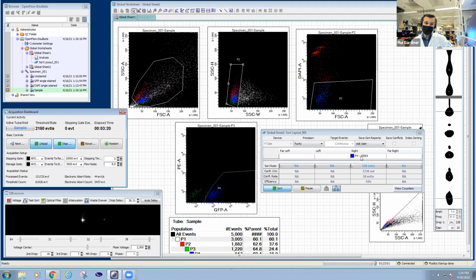And now, like I said, the important thing to take into account is the efficiency. So this gives us a very good sense of how good this single cell suspension is, and also if there's any interference, either from the instrument, but mostly from the sample, that will be causing this loss of efficiency. What is the efficiency that we should expect? I would say anything between 70 and 85% is a pretty good efficiency. In this type of cells, we don't expect such a good efficiency, unfortunately. But you're seeing here that since the number of events are oscillating a bit, it's also hard to say exactly what the efficiency is.